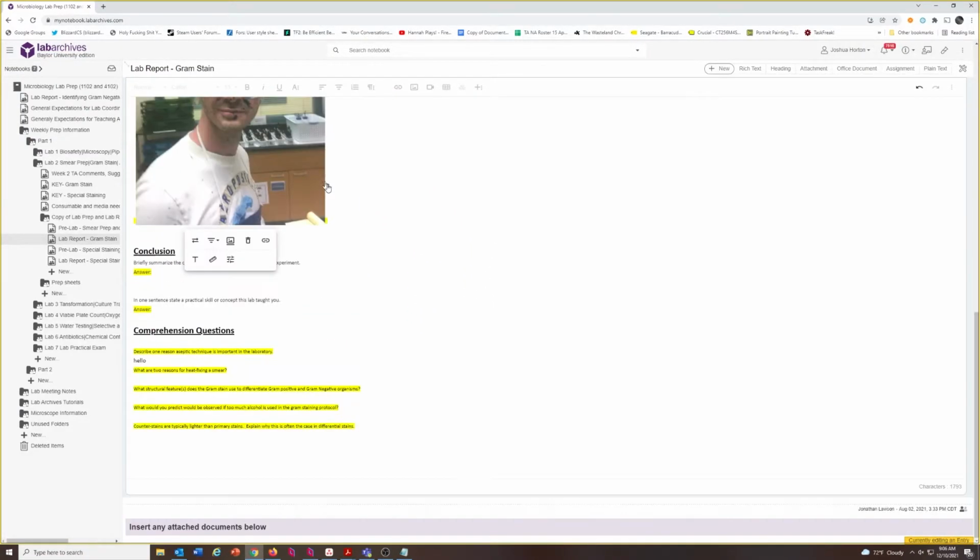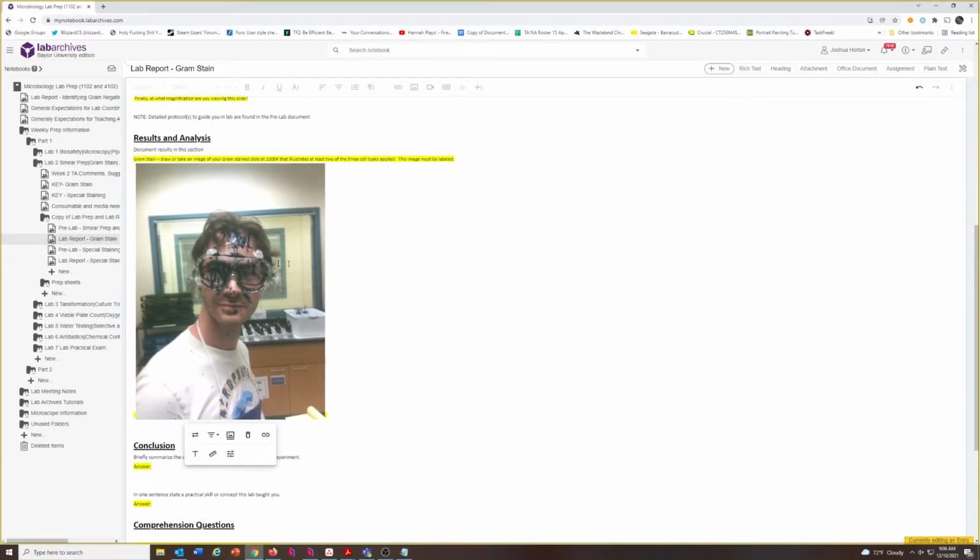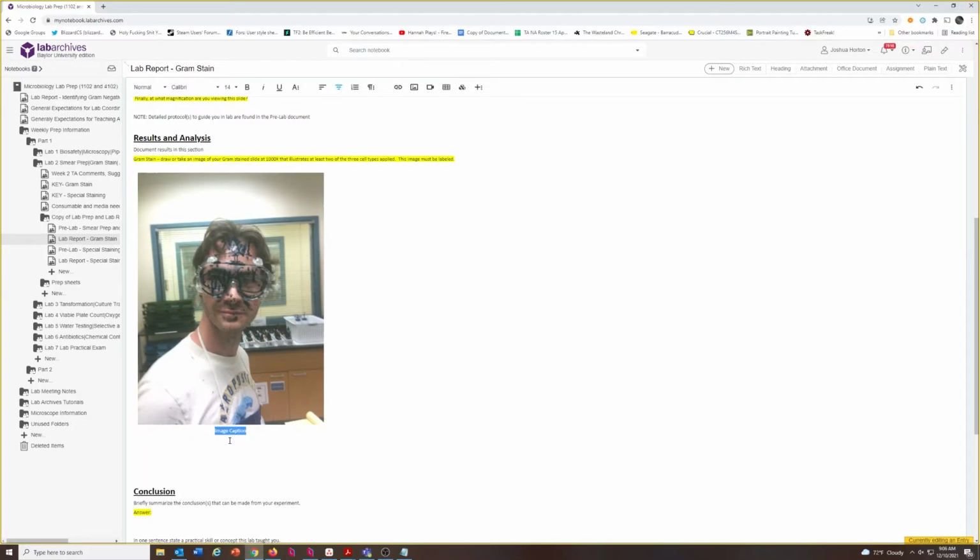Now I'm doing this on a computer, but you guys will have time to edit on your own computer if need be, but you can also do all these edits on your phone as well. Down here, you guys can see a set of options. These options include things like put in an image caption. Hey, this is what this image is.